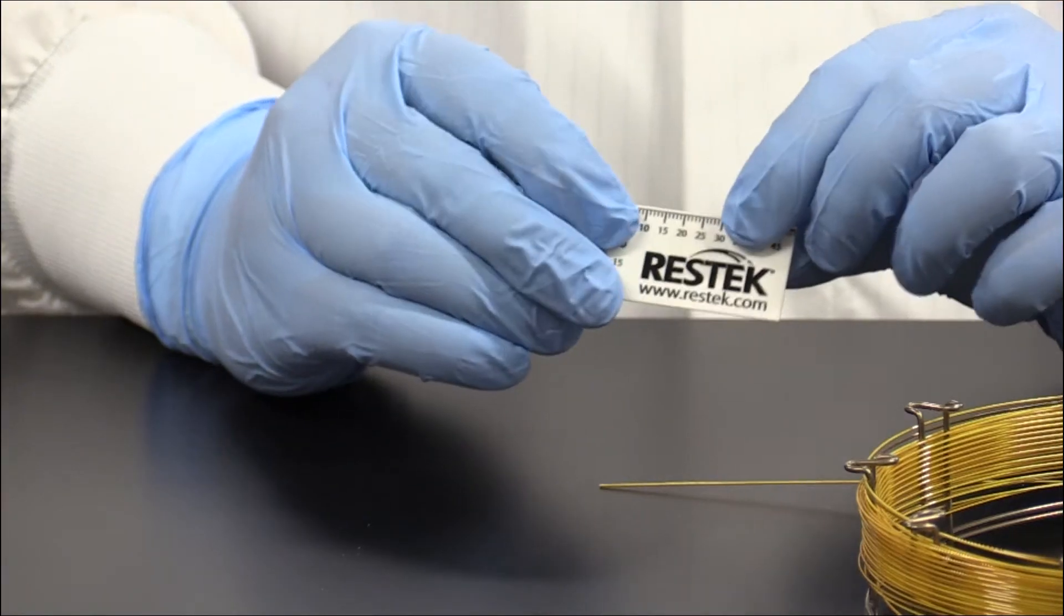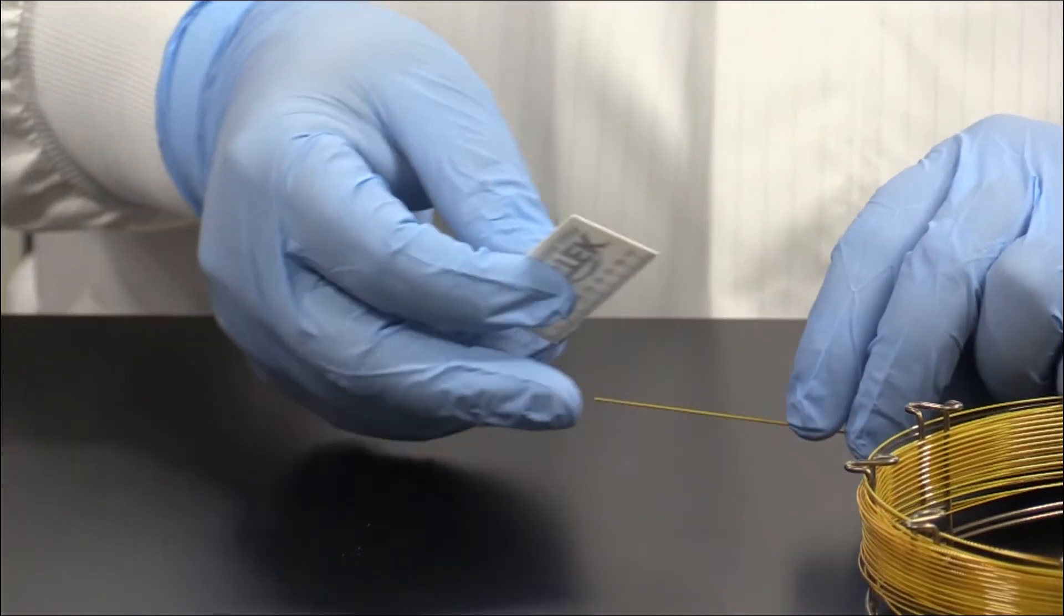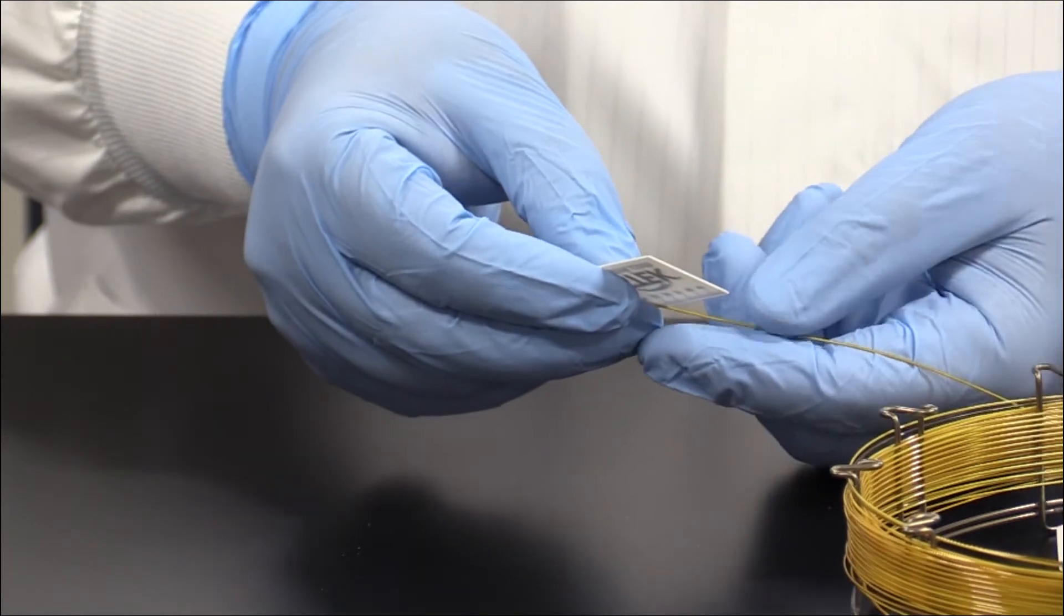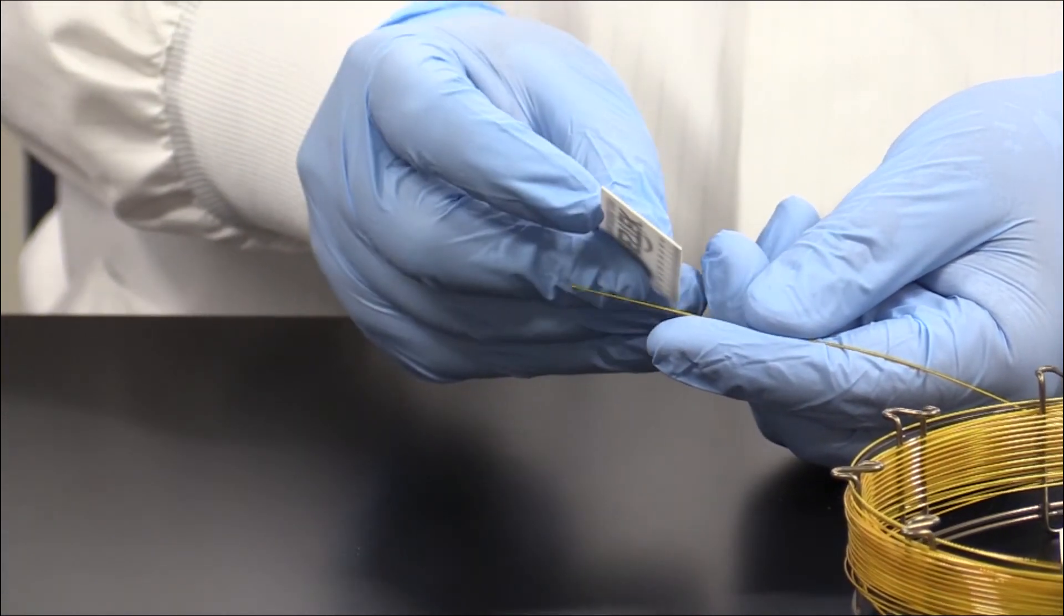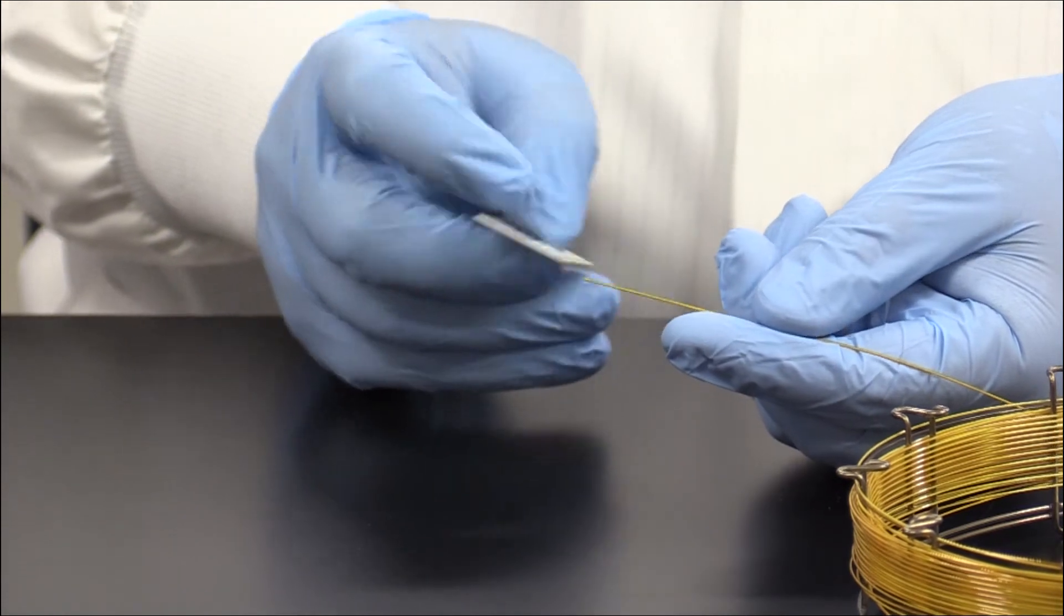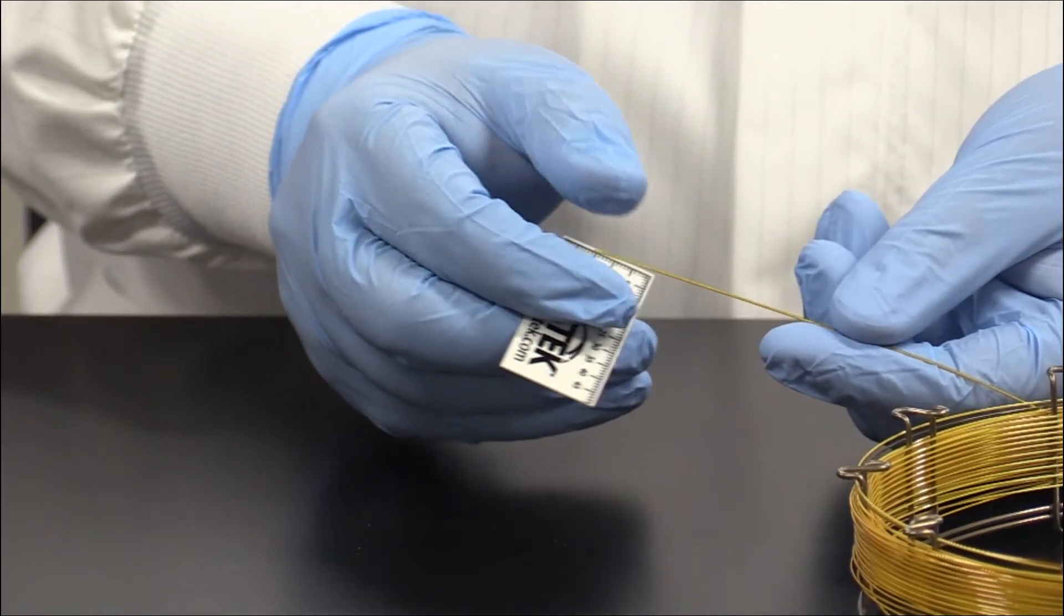And when we do that, we'll just lay the column along the length of our finger and run the ceramic scoring wafer perpendicular to the length of the column. We want to use that smooth edge to place a small score in the polyimide layer on the outside of the column.